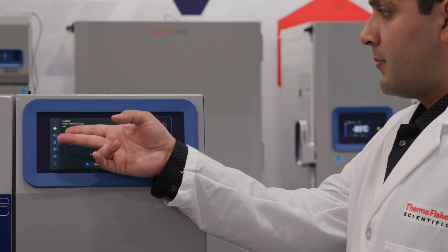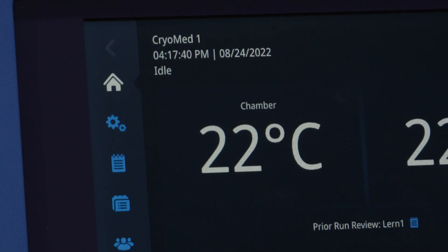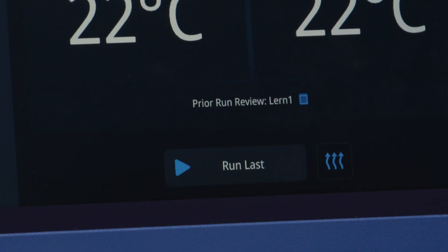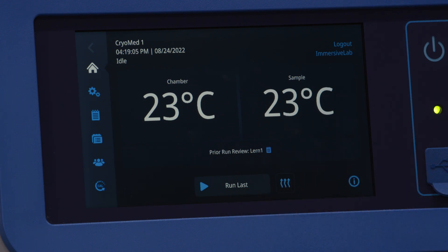This model now provides a sleek, new, and intuitive 7-inch control panel at the front of the unit. The home screen has four key elements, or panes, starting with navigation icons on the left. The top pane displays login, date, time, operational mode, connectivity detail, and an alarm indicator. The middle pane will display chamber and sample temperatures, along with previous run detail. And the bottom pane contains the run last, warming mode, and onboard help buttons.